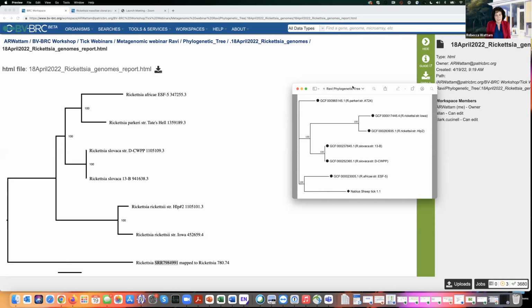I would first select genomes that are good quality. Another thing I would select is, if I was making a tree, I would look at reference or representative genomes. These are the GenBank gold standard genomes that they have established. So they're generally good quality data to look at. And then you can just branch out.